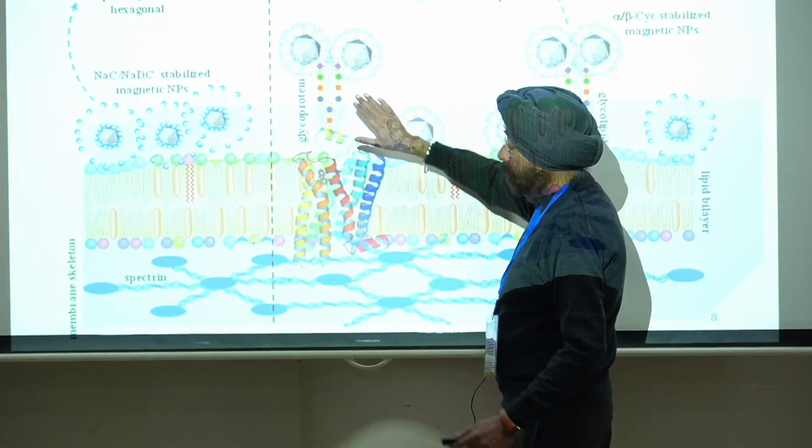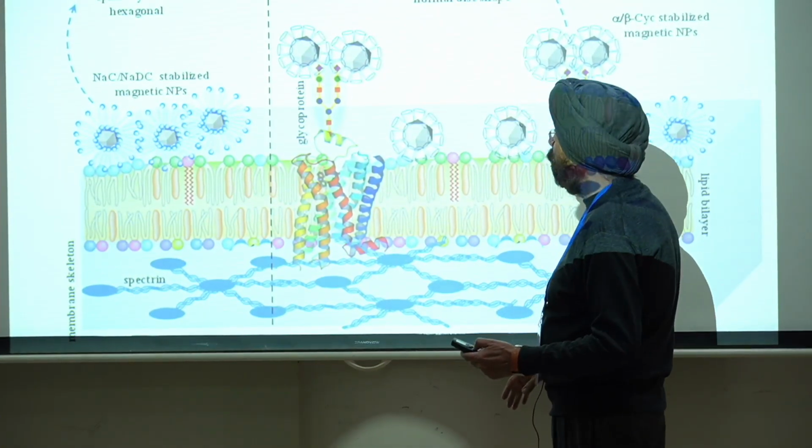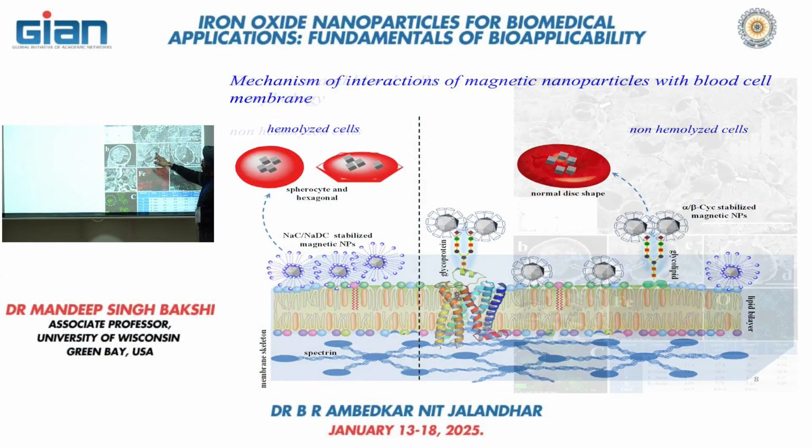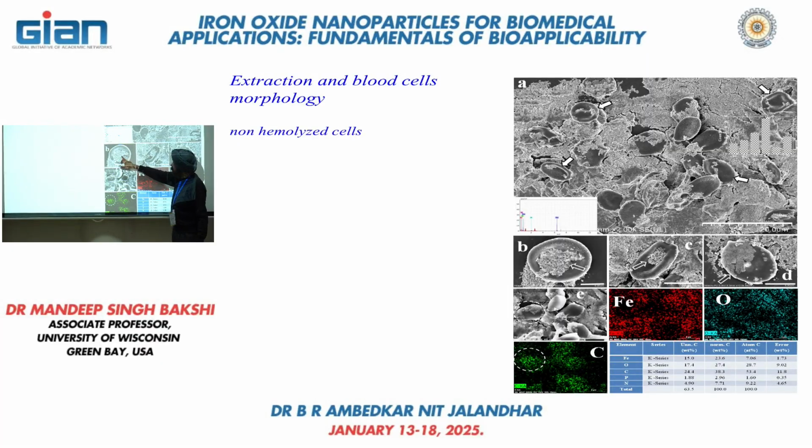There are several magnetic nanoparticles. Those are going to anchor. You see, several magnetic nanoparticles anchoring to just one blood cell. And hence, when you are going to apply the magnet, the magnet is attracting the magnetic nanoparticle because the blood cell is not magnetized, right? So when you are applying the magnet, the whole assembly is dragged towards the magnet. This is the extraction, the whole assembly.